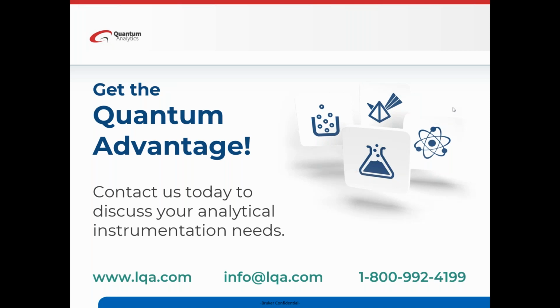So, okay, I want to do the OQ every 3 months. I want to do the PQ daily, and that's what they'll set up. And the software will be set up to just go from there. Do you want your reports printed out or just saved to disk? So those are just done right up front. You can go back and change those easily yourself at a later date. The user interface is also tiered, which is important. So you can have an administrator or lab manager that has the ability to change different things in the software, and then your operators will not have the ability to do that. And that's the most common implementation that people use.